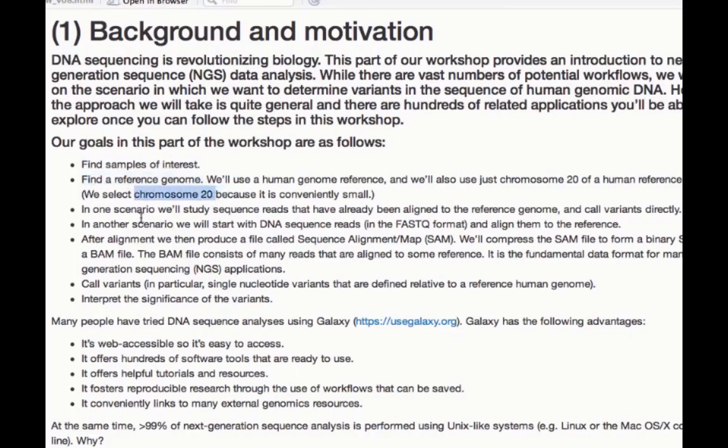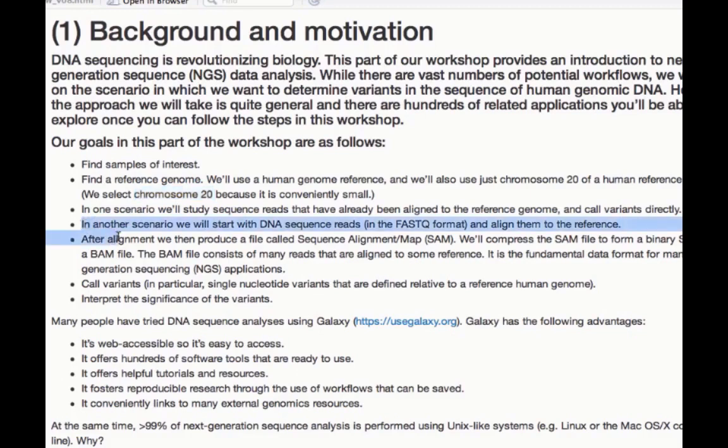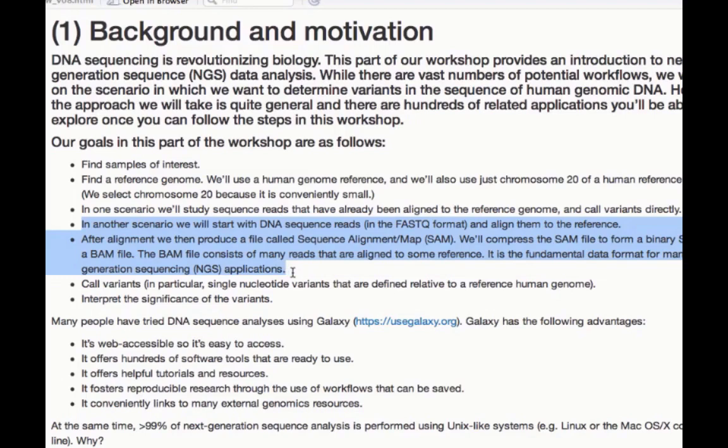In one scenario, workflow one, we'll take a look at sequence reads that have already been aligned to the genome and call our variants. In our second workflow, we'll do something more complicated and go through a series of steps that leads us to the same result, finding variants by doing the mapping and the alignment ourselves, and then the variant calling. In the end, we want to also interpret the significance of the variants that we find.